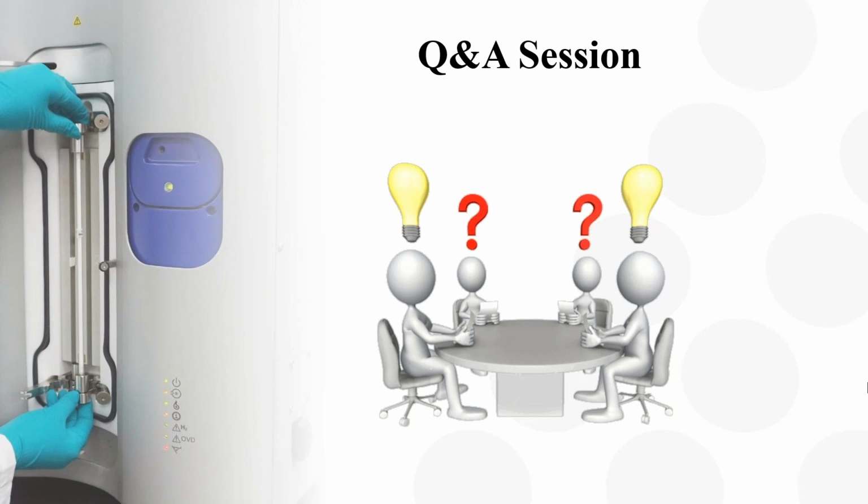So I have one question. What is the minimum limitation for IGC to determine BET surface area? And is it possible to determine some metal powders, which would be difficult to get reproducible results with the nitrogen adsorption method?